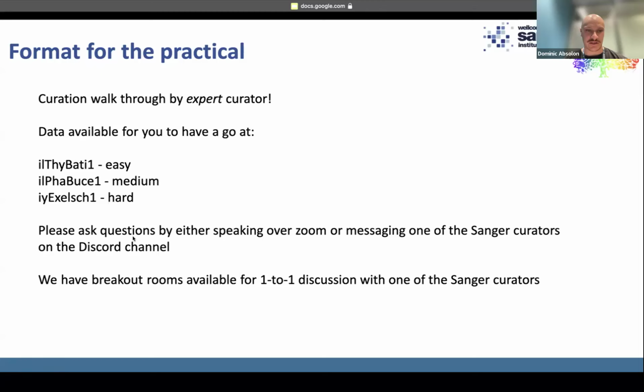But as I said, if you have any questions, just pop them in the Discord channel. We also have breakout rooms available. So if you have a more challenging problem you want to ask about, you can ask to go into a breakout room. One of the curators can join you in there and you can share your screen and we can talk through what's going on.